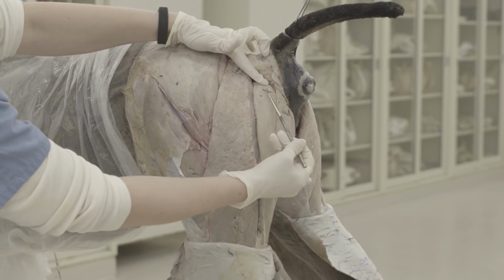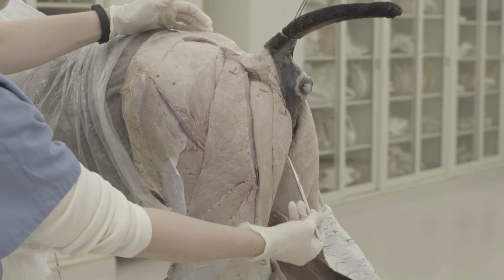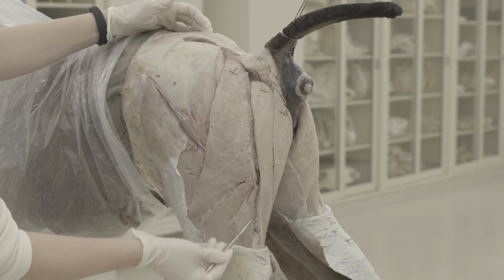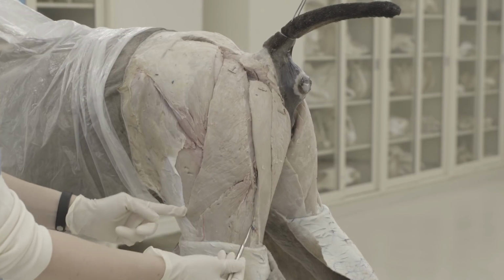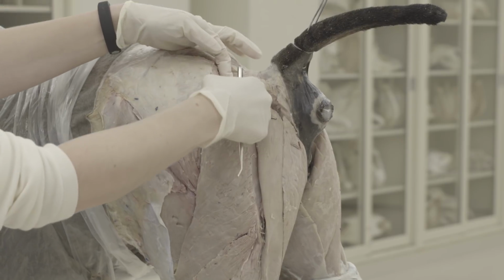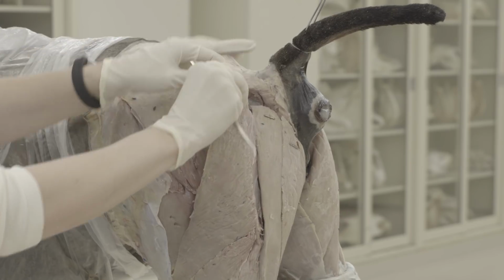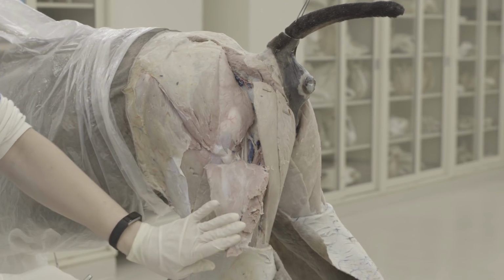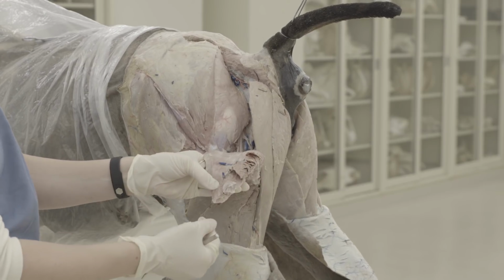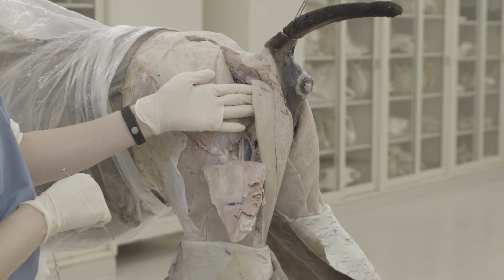Then semitendinosus is the next muscle here, and semimembranosus is the most caudal one here. So first find your biceps femoris, identify those borders, and then you can cut it. So you're making a proximal incision here and then reflecting the whole muscle. So this is a pretty big muscle, and you want to take the whole thing down, reflect it distally towards that stifle. You'll run into some vessels, and you can just go ahead and cut those as you reflect the muscle distally. And then you're going to do the same thing with your semitendinosus muscle.